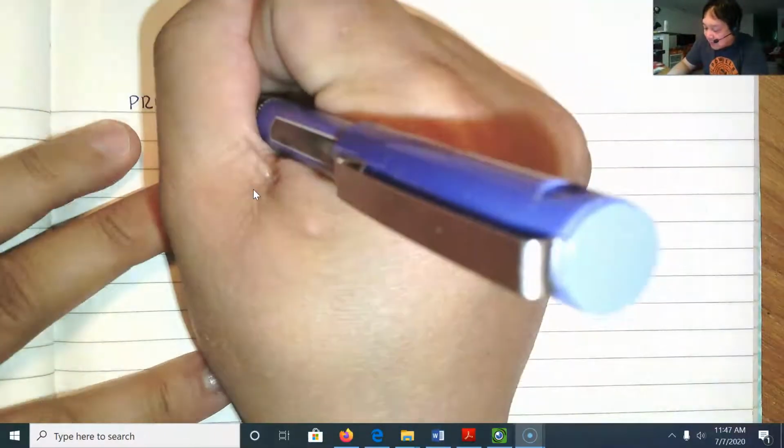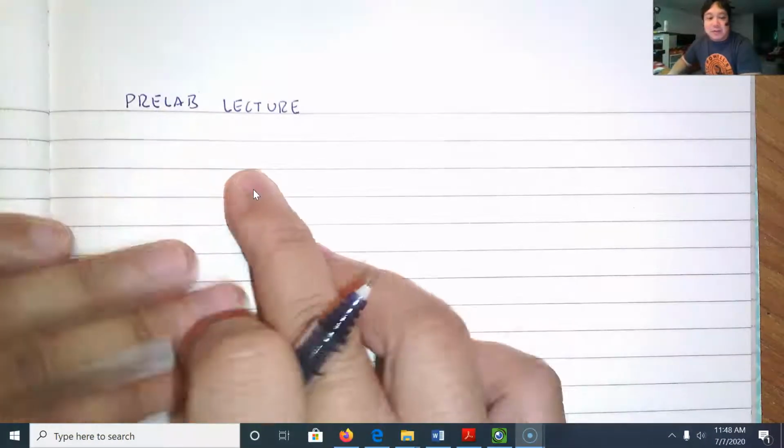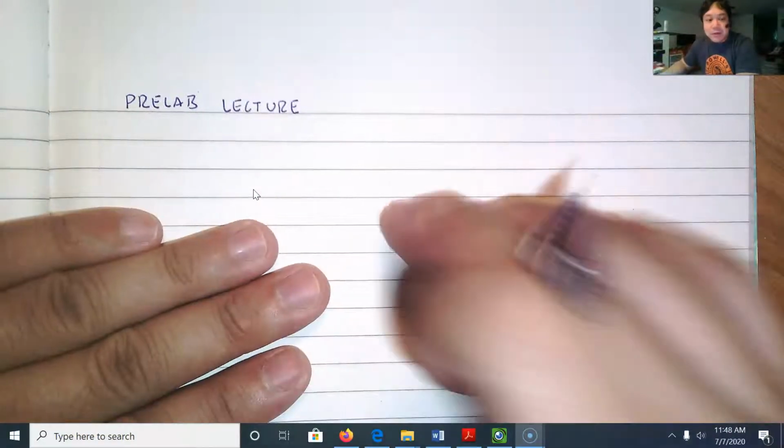I'm going to suggest that people only write on the right-hand side of the lab notebook. Okay. So let me give us a title. This is just the pre-lab lecture. Pretend that you're in the lab room, and before anyone picks up any glassware, I'm going to give a pre-lab lecture.